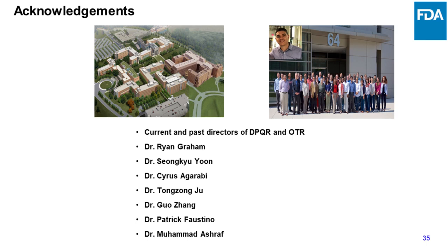Yeah, this is another important question which leaves us open to so many things because, as you can see, in bioprocessing, cell culture is a very complex process. Various factors contribute to the overall performance of the cells in the bioreactor. We considered different cell culture media perhaps having different compositions, because you do not have the proprietary data on each and every component of the cell culture medium. There is also a possibility of the bioreactor apparatus itself, because you will have stainless steel components going inside the bioreactor, and they may contribute to some extent over the course of a 10 or 15 day bioreactor run.